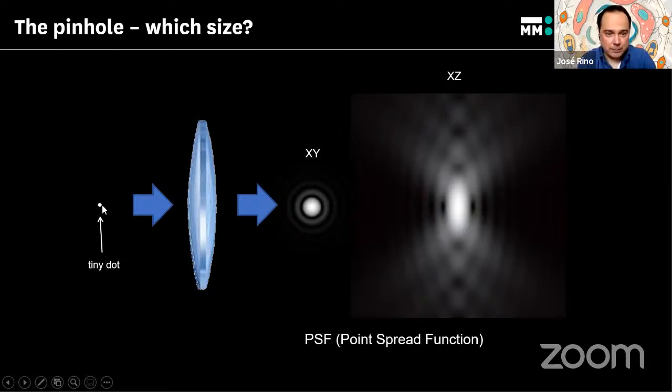No matter how small the dot, if it's below the diffraction limit, you always see a point spread function of the same size that will depend on the wavelength of light and on the numerical aperture of the objective, if you remember from David's talk. So, we're scanning point by point, focusing light on a single point in a specimen. If we have a single fluorophore there, what will reach the detector, reaching the pinhole, is this point spread function.